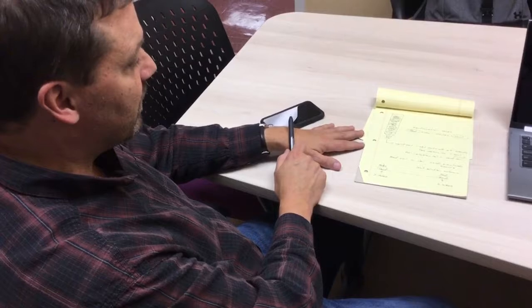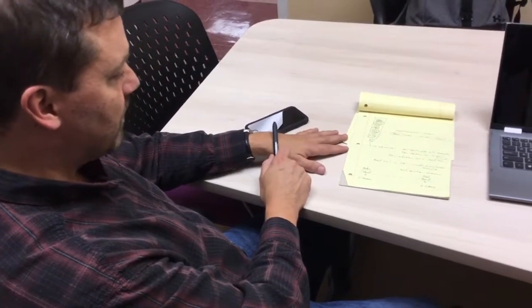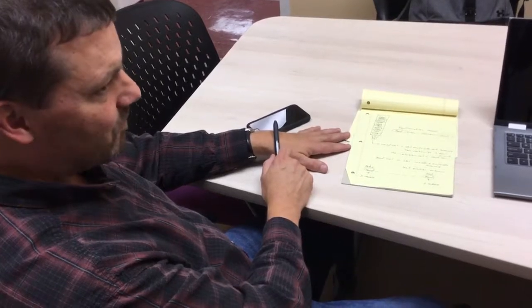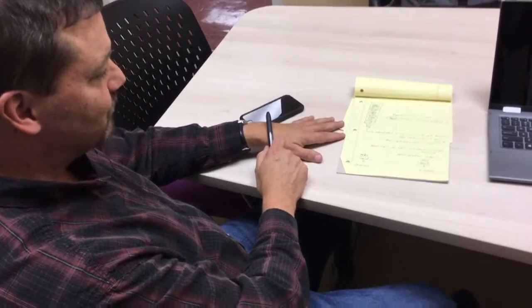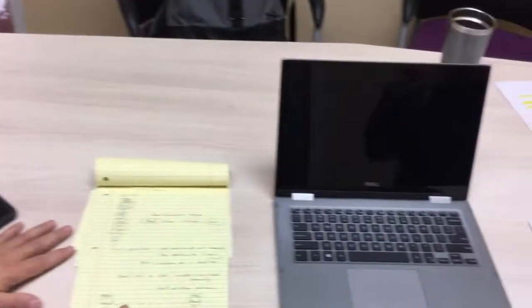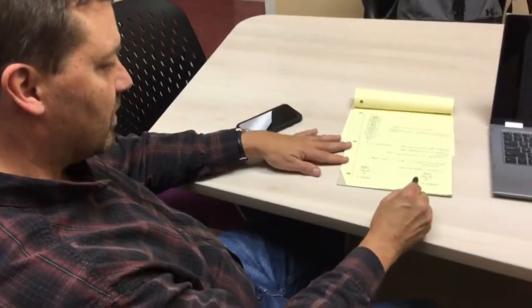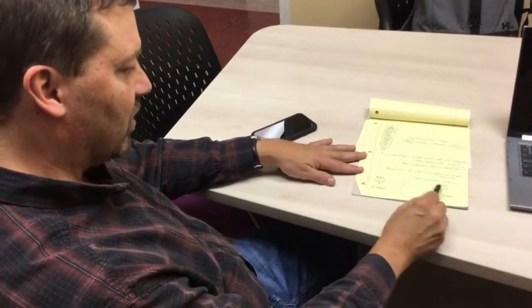Yes. Thank you. That makes sense. Those were my big questions, but I'm gonna dig up some more. And this is the fractionation range. So you're getting effective separation between the void volume and the bed volume.